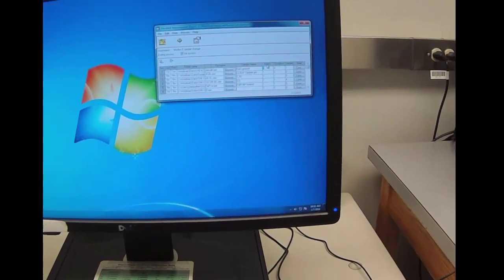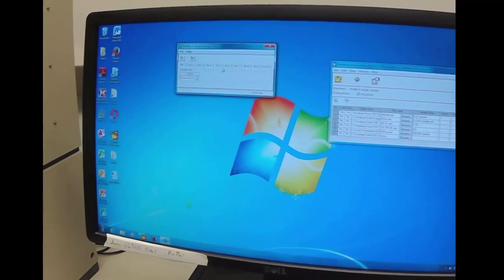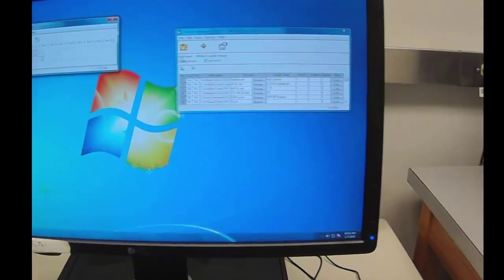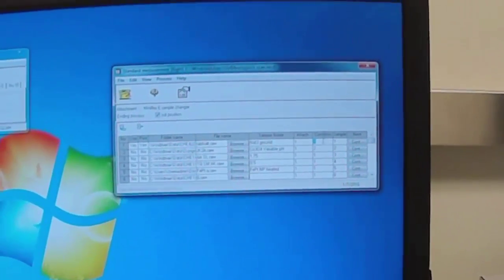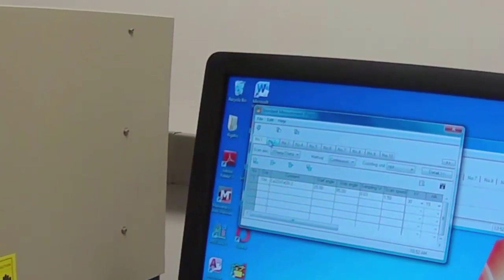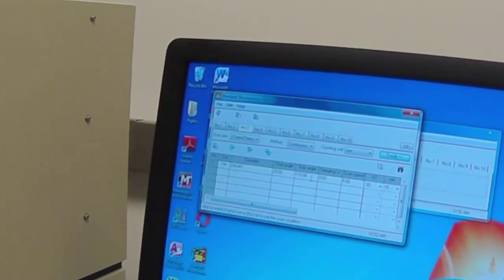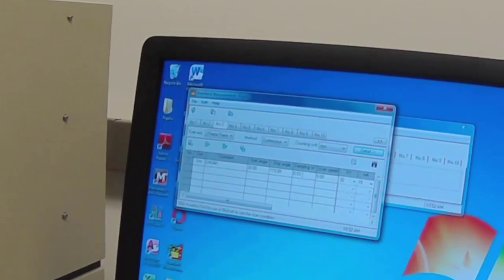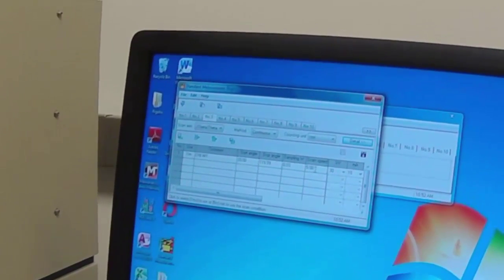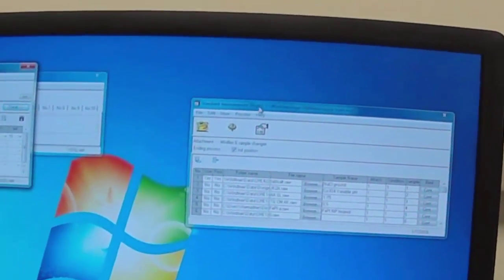The attachment is going to do number 1. So attachment number 1 condition means it's going to rotate. So yes, that's what we want. And then the scan condition is number 3. So let's look at that. Scan condition number 3 is for our class, 20 to 120 degrees, 0.03 degrees per sample at 5 degrees per minute. So yes, that's the one we want to use.